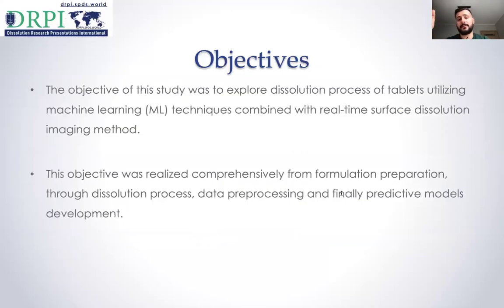The primary objective of this study was to explore the dissolution process of tablets using machine learning techniques supported by real-time surface dissolution imaging. The approach was comprehensive, encompassing formulation development, dissolution testing, image processing, and predictive model construction.